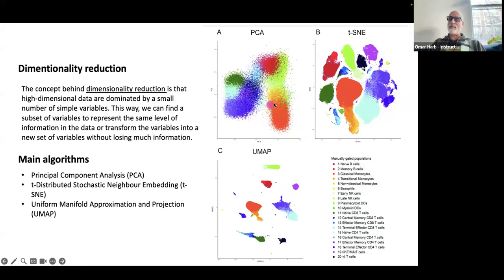And there are some differences between these methodologies, including whether the axes mean something. In PCA plots, you're actually teasing out the cell types based on basically a principal component. And so most of your variation in your cell types is going to be due to maybe two or three, maybe one or two effects or conditions that you'll be able to tease out here.